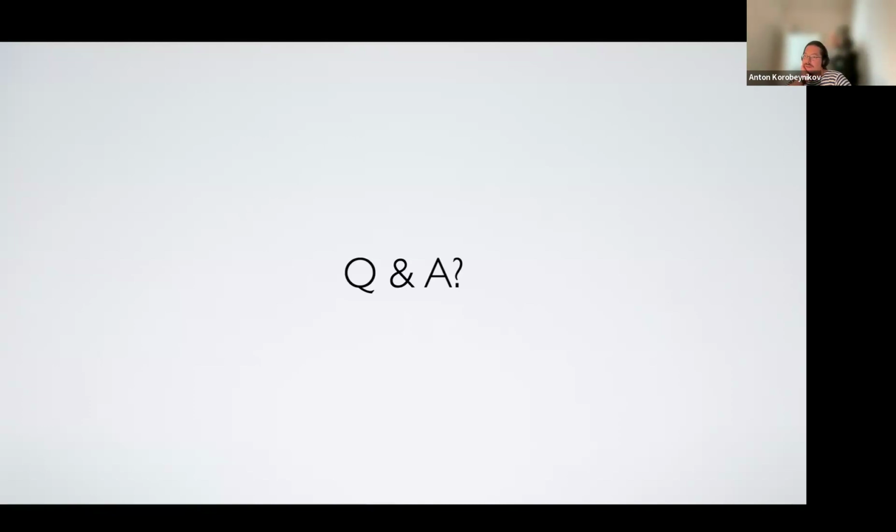We can have a few questions, or if not, we can just move to some hands-on. I think you covered absolutely everything in that presentation, to be honest. Well, I have not touched more on the editing because it's a little bit advanced, and I don't want to touch it because if you try to edit things, you change the underlying structure, meaning you need to be pretty cautious. It's not just point and click.